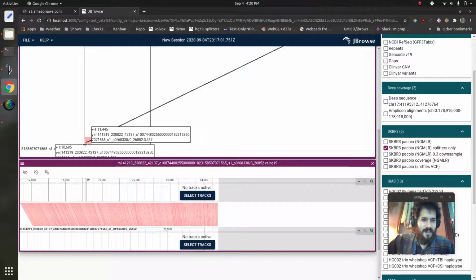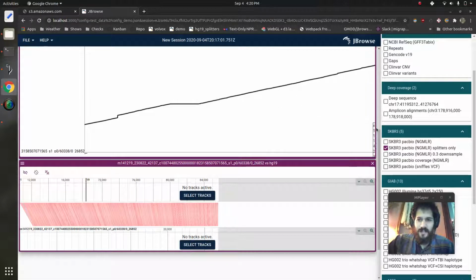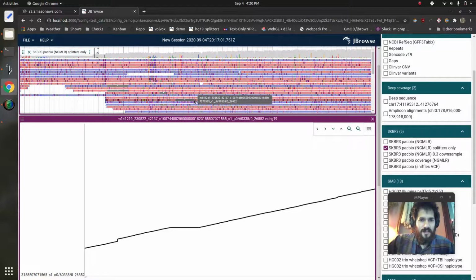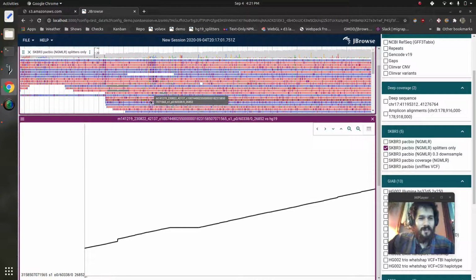We can actually zoom in on this region, and you can see that this corresponds with our notion of the alignment from up top here. So this deletion is this block right here, and that shows how the read being plotted on the y-axis doesn't contain the same sequence that's on the x-axis, the reference genome. And there's also a little insertion, which is sometimes harder to see in these reference genome coordinate based plots.